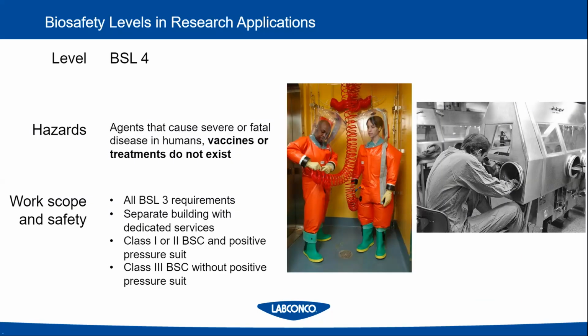Finally, a BSL-4, this is a pretty high-level biosafety lab. This is really only for diseases and pathogens that cause fatal disease in humans with no vaccines or treatments. So think of the most serious hemorrhagic fevers, Ebola, Marburg virus, things like that. BSL-4 labs are really rare, and we're not going to be talking a lot about them today. Either a researcher would have to use a positive pressure suit with a biosafety cabinet, or a class 3 biosafety cabinet, which is completely sealed without their positive pressure suit.